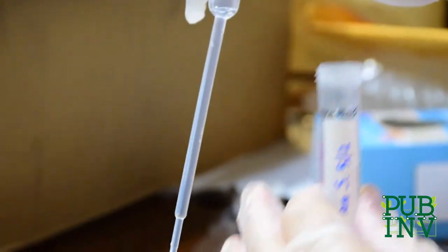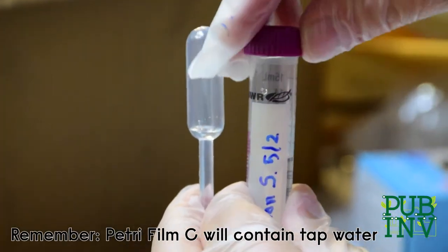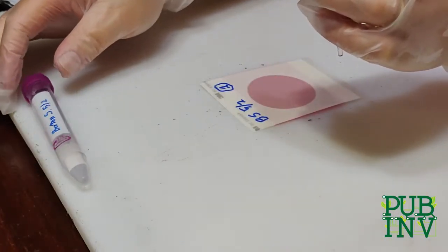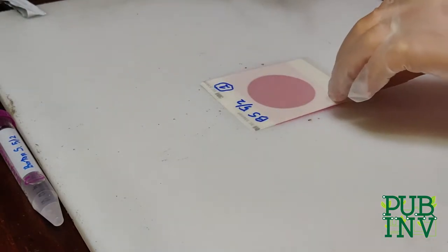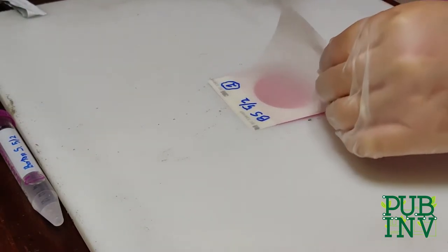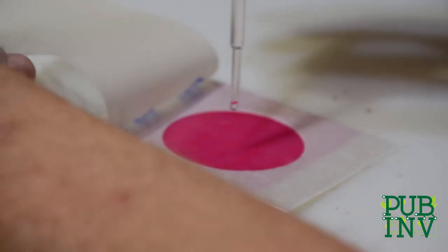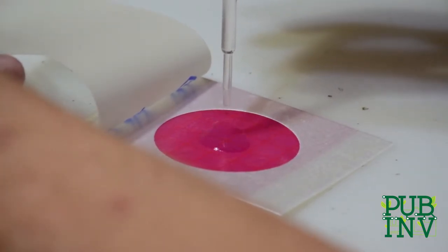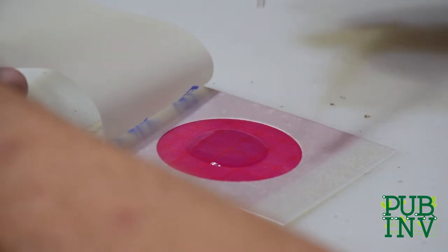When you're ready, you want to use a pipette to drop 1 mL of your control water onto the petri film labeled C. Lay the film on a flat surface with the flaps opening towards you. Fill a 1 mL pipette with water. Lift the flap on the first film and use the pipette to gently spread the solution onto the film. Make sure the pipette does not scratch the film surface and that the water doesn't overflow the film's circular area.